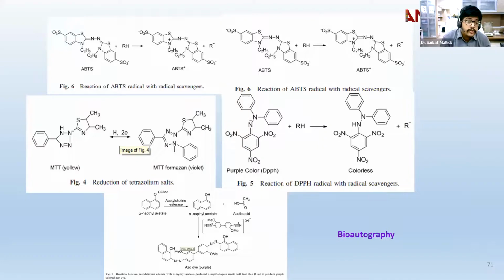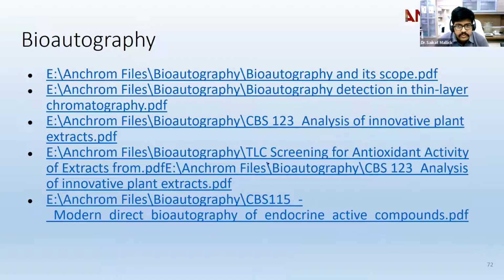Today, what we are going to see is the DPPH activity for antioxidant determination, because we have limitations at our residential facility to have a microbiological lab. So we will be showing you that experiment. And there are so many types of reactions which are there. Similarly, there are so many papers, so I will just try to show you a few.